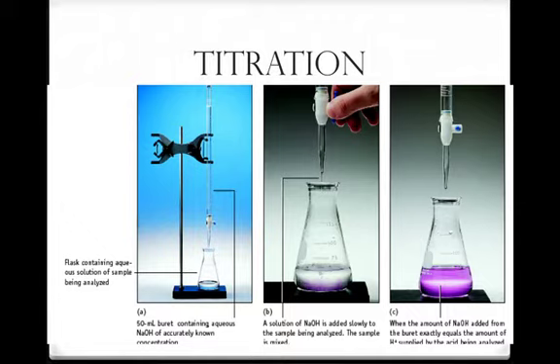All right, so this is an example of the apparatus we use for titration. We have our aqueous sample at the bottom. We're going to add a little bit using this little stopcock here. If you turn the lever to the side, it'll turn it off. If you turn it so that the lever is with the solution, the solution will go out. If you are very, very careful, you can turn it so that one drop at a time will be added.